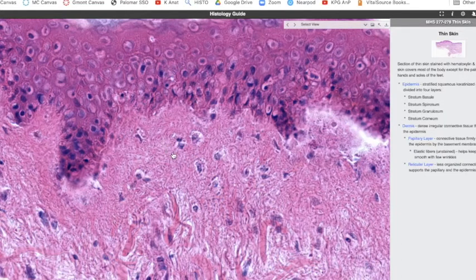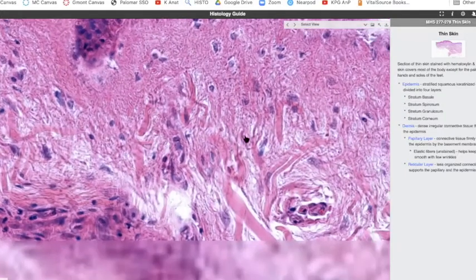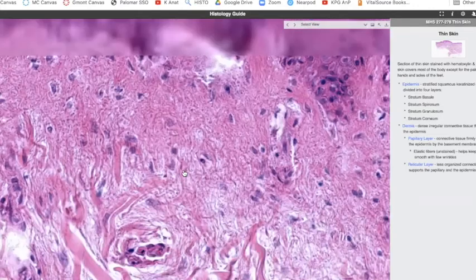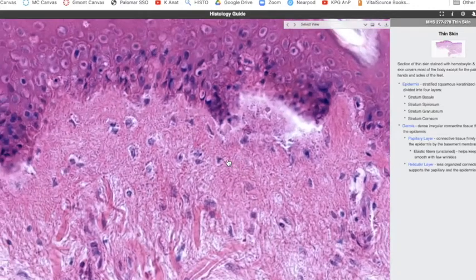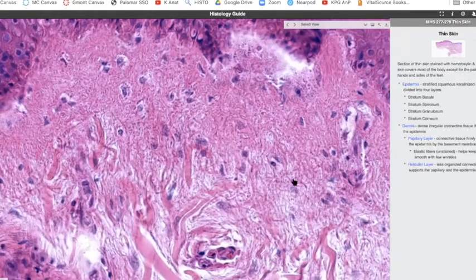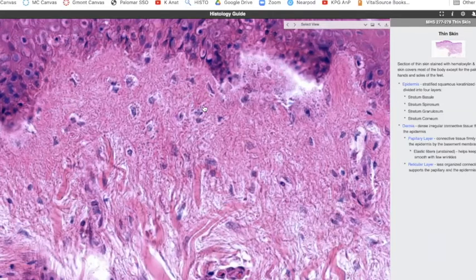This is all a loose connective tissue, right? How do you know it's loose connective tissue versus dense connective tissue? Because you wouldn't know it just by looking at it, right? How you'll know about it is by location. Here's the epithelial cells. Epithelial cells are always sitting on a layer of loose connective tissue. This isn't the best picture of it, but you could see down here, there's kind of like little strands of it over there, even if it's closely packed in, right?